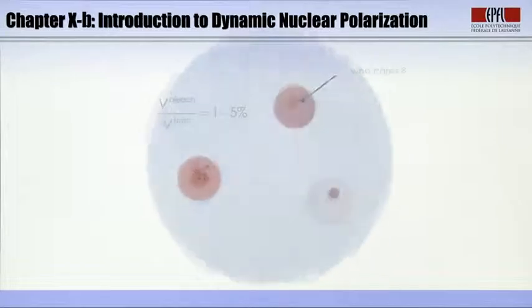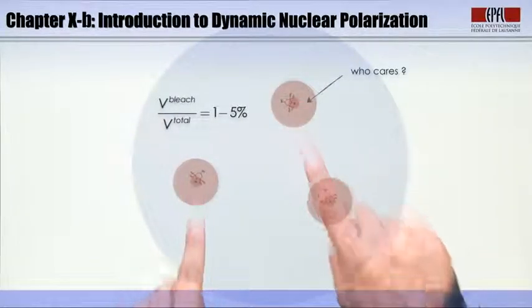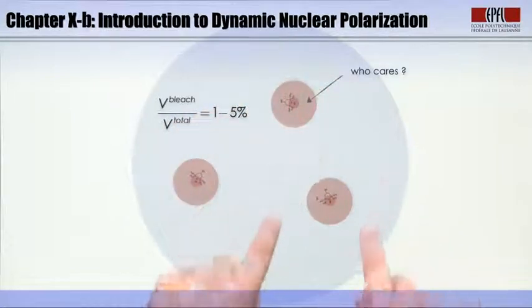So in our sample, you have electron spins. Around these electron spins, you have a diffusion barrier so that the nuclear spins inside won't talk to the nuclear spins outside. But most of the nuclear spins are sitting in a space where the dipolar interaction with the electron is relatively weak, and we call these the bulk nuclear spins.